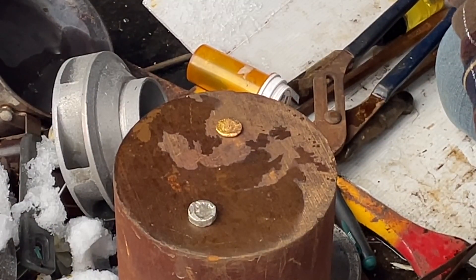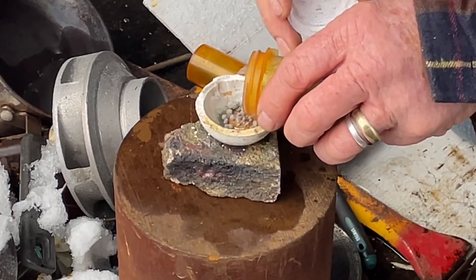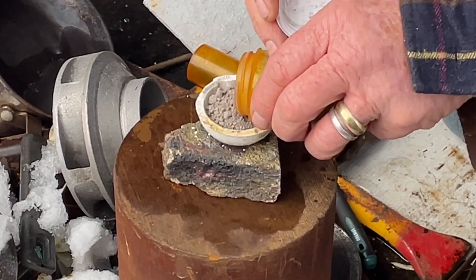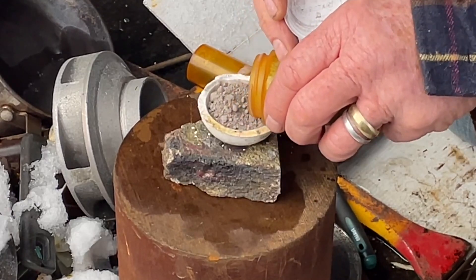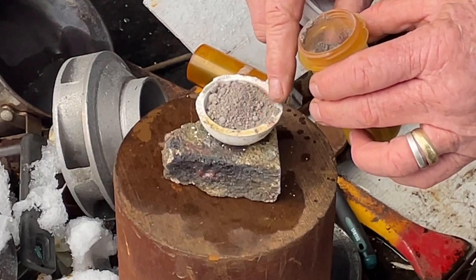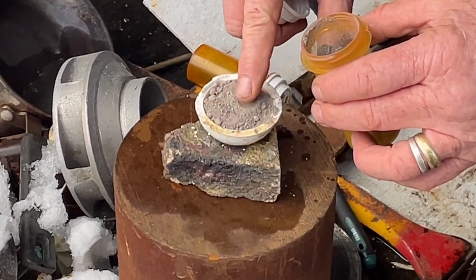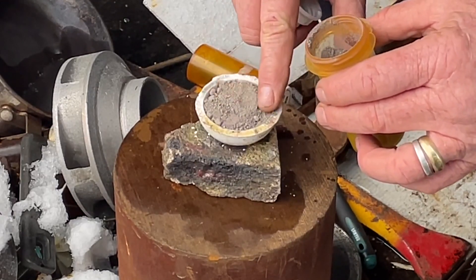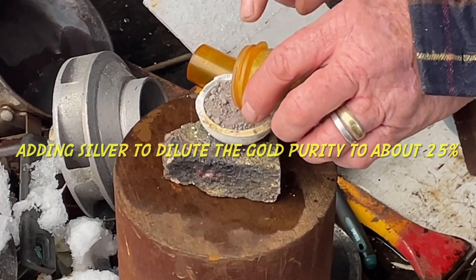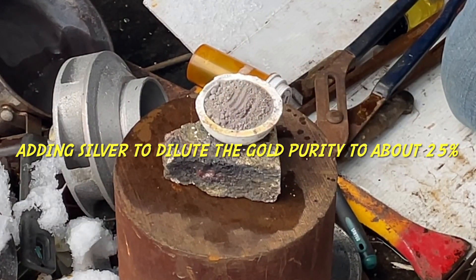I don't know, probably should. I'm gonna guesstimate it here because I'm a professional — I'm gonna guesstimate it right to the top of this crucible. That should do it. That looks sufficiently good — nice pile of silver, should be roughly an ounce.